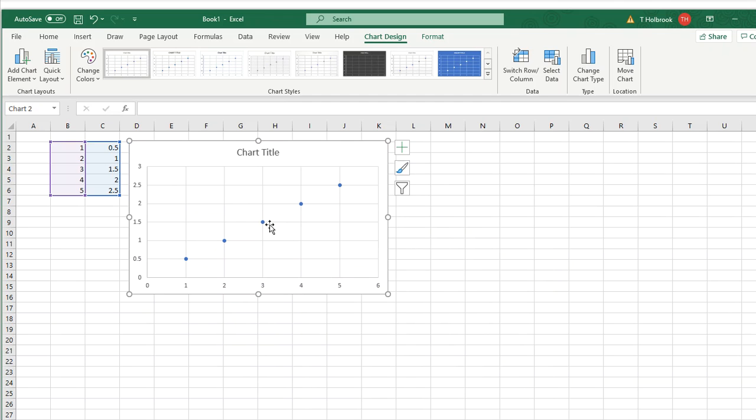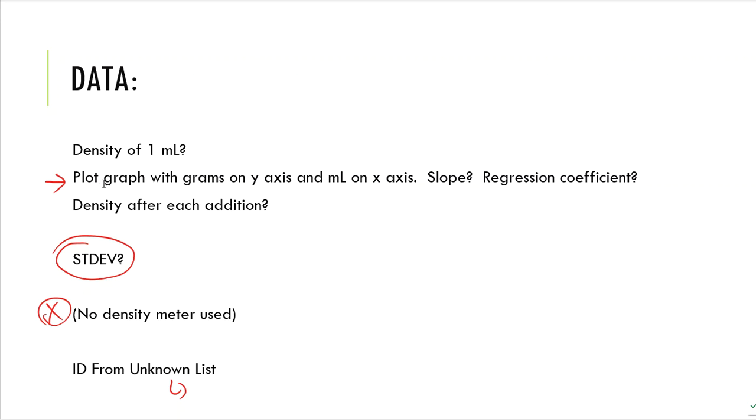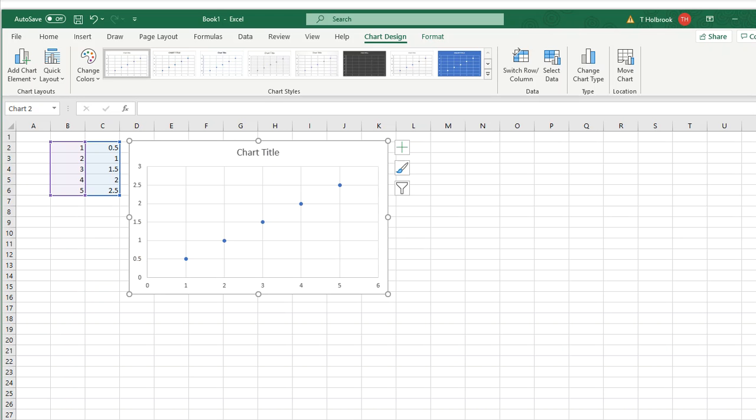It looks like it's going to form a line, which is a very good sign that I did a pretty good job maybe with the measurements. All right, but this doesn't tell me anything yet. So I need slope. I need slope of this line because if I get slope, that's going to give me my density. And in addition to that, it's going to ask a couple of things. It's going to want to know slope and something that we call regression coefficient. All right, so what is all of that mess?